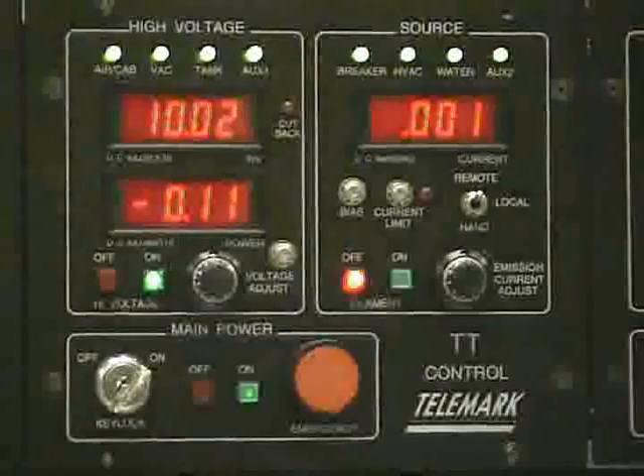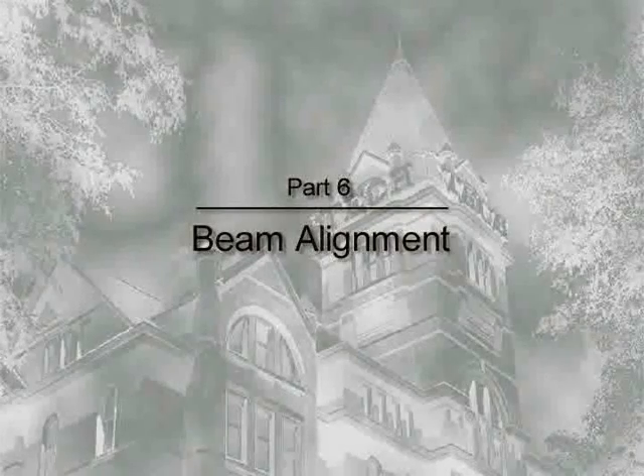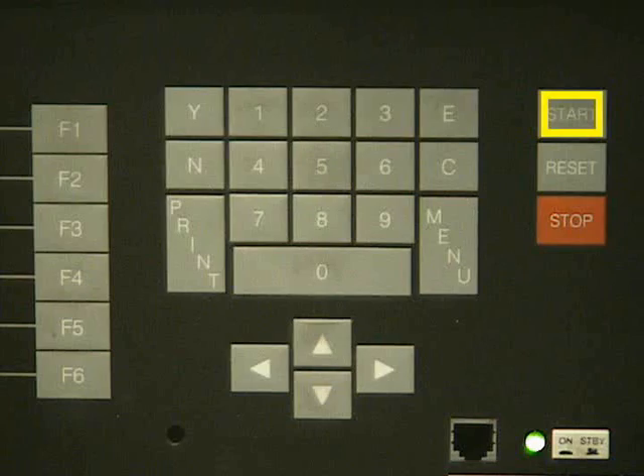Next press the high voltage on button. Then set filament to on. Once the pressure has gone down to the desired level, press start on the deposition monitor.